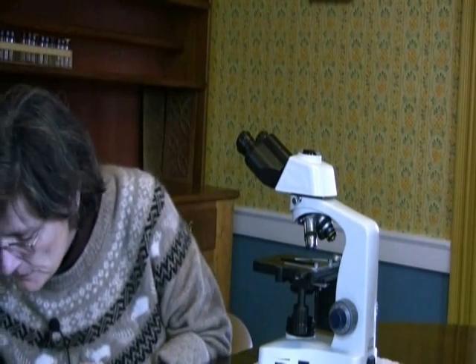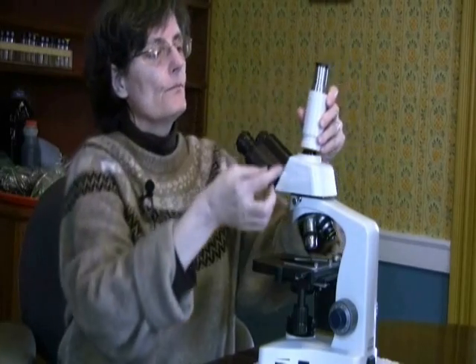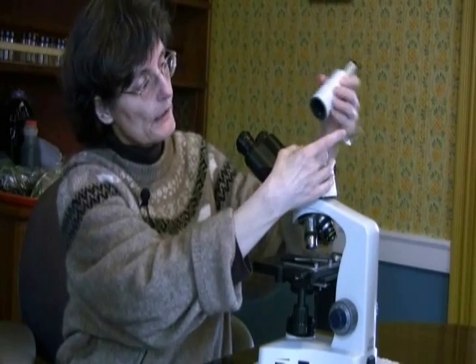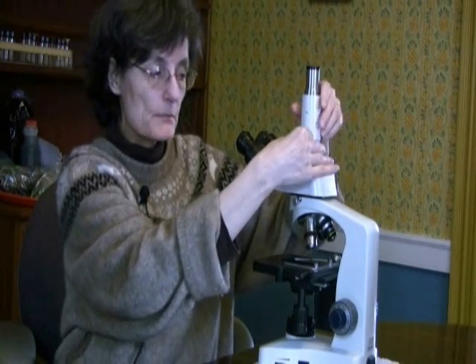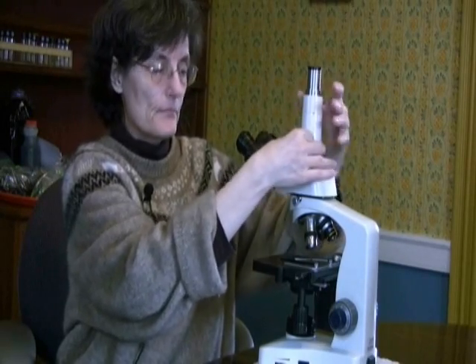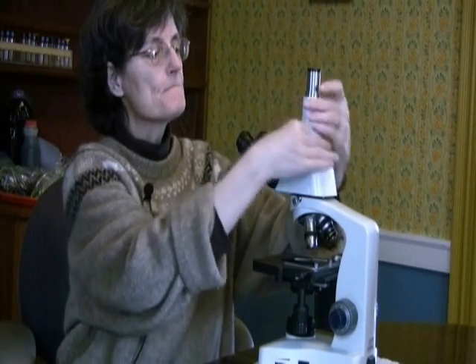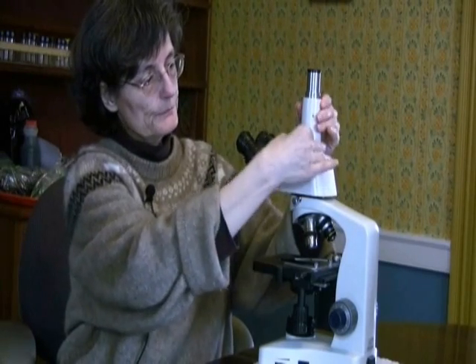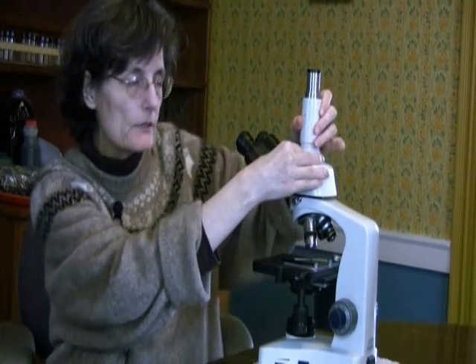You might then want to find your trinocular head and actually put it on there so that we're getting all the pieces together. And in this case, if you look on the inside, you can see there's threads in here, there's threads on there. So you just have to thread that on, and sometimes it can be kind of fun to get that to sit on there correctly. You don't want to be forcing anything, it should go pretty easily. And now we've got that trinocular head on the microscope. Finger tight, you don't want to crank it down, because you're going to want to take this off sometime.